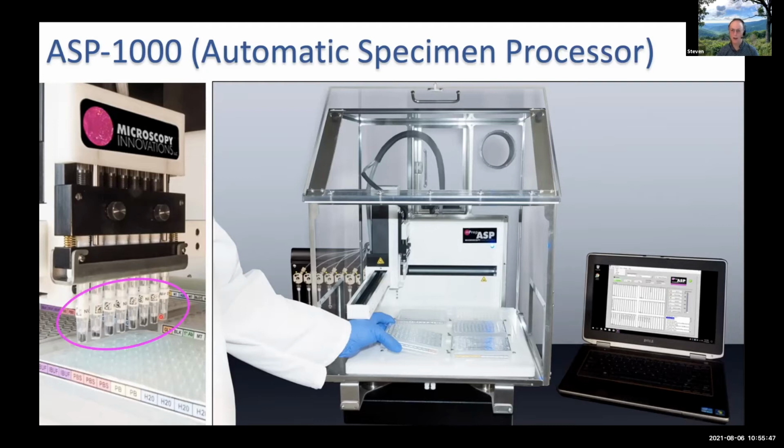Grids mount the same way. I'll show that later. The reagents are loaded into microwell plates. Here, this one is labeled for the different reagents. And each capsule follows a different path through these well plates. So this first capsule will draw in processing reagents from the first row in the microwell plate. And in that way, each specimen can, when you desire it, receive a different sequence of reagents. So you can accommodate those controls and things.